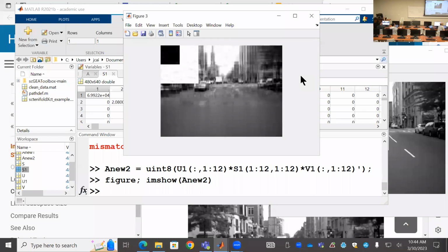You can learn these major components in your whole matrix. That means we learn the major genes, or major clusters of cell types.